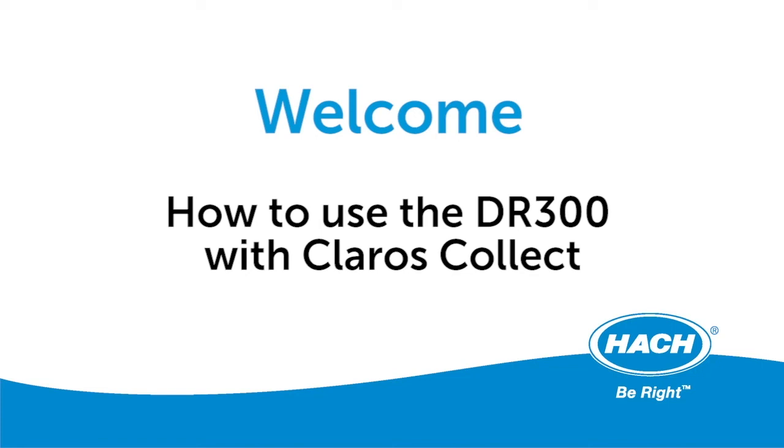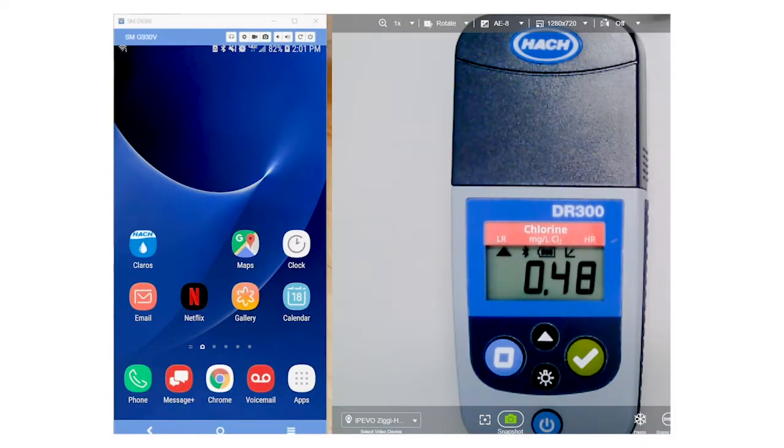In this video, I'll be showing how to use the new DR300 pocket colorimeter with Claros Collect. I have the phone displayed on my desktop here so we can see what we're doing. I'm going to go ahead and start up the Claros Collect application.